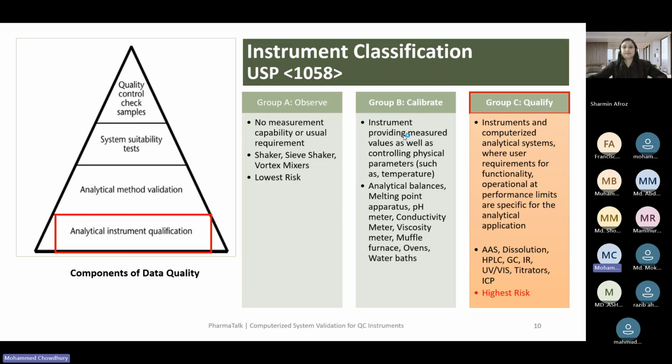Maybe we can later arrange other sessions on AI-driven validation, data governance, and data security. Inshallah, we'll arrange these topics. So now I'm going to conclude today's session. Today we covered the regulatory landscape for computer system validation. Specifically, we covered QC equipment, QC systems, and analytical instruments.